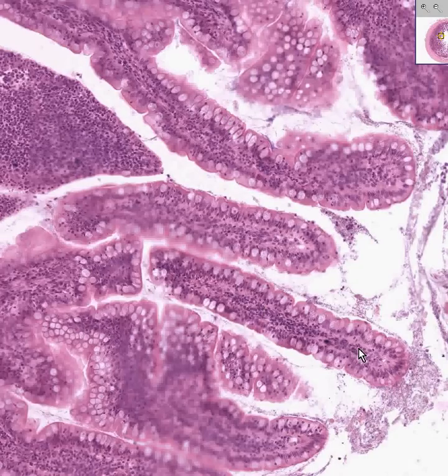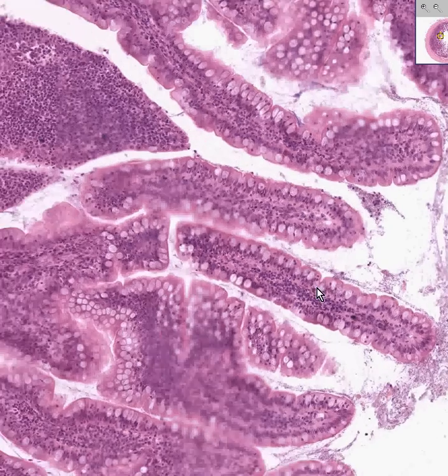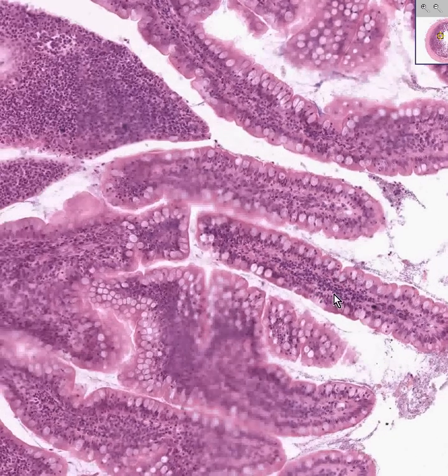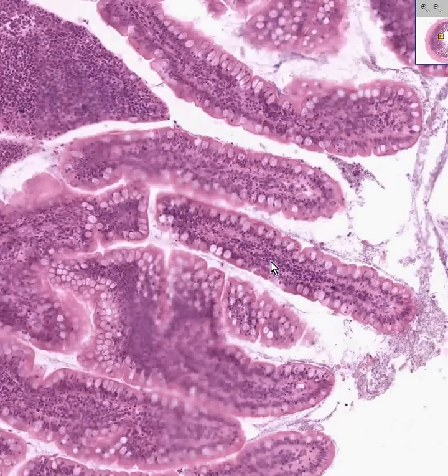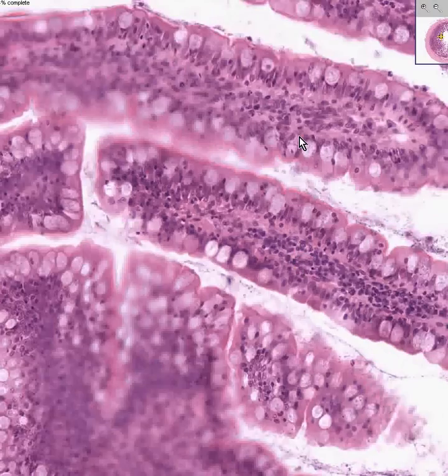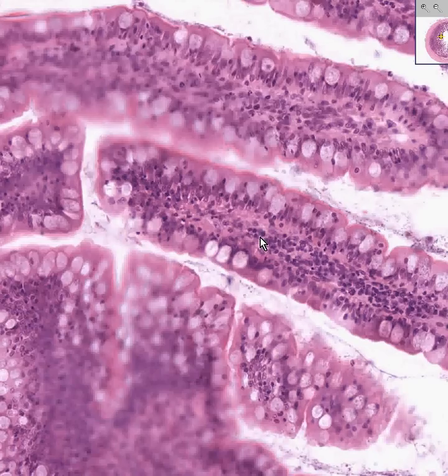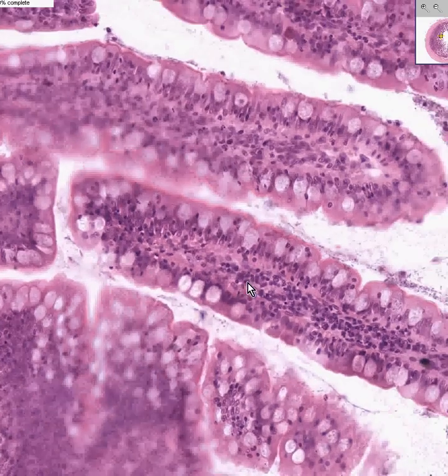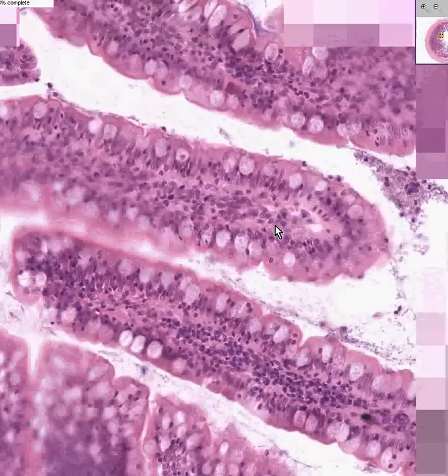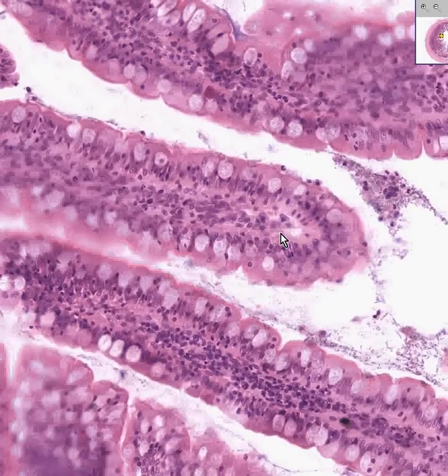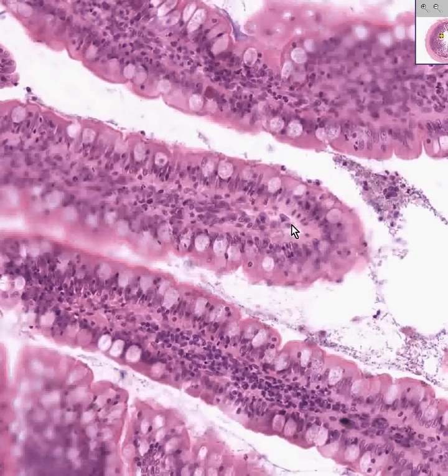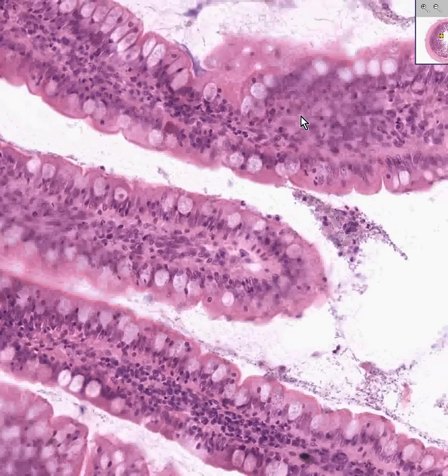The lamina propria constitutes the core of these papillary or villus structures in the mucosa. Like any other lamina propria, it is rich in cells like lymphocytes, macrophages, fibroblasts, and blood vessels. In addition, you will see many lymphatic-looking spaces — thin endothelial-lined spaces with no blood cells — which are the lacteals.